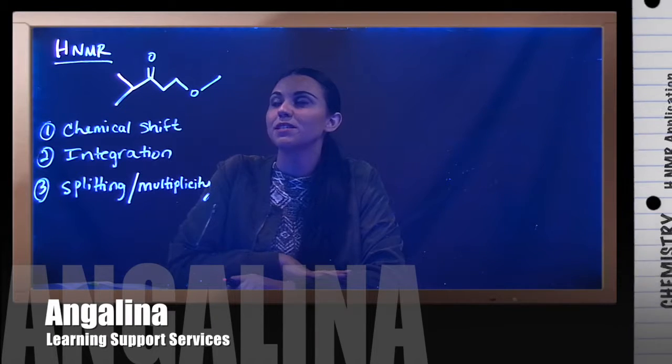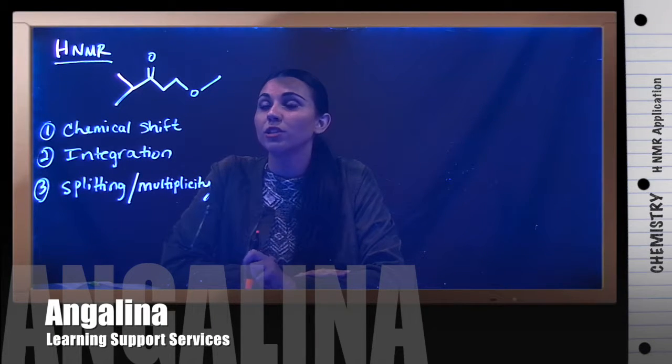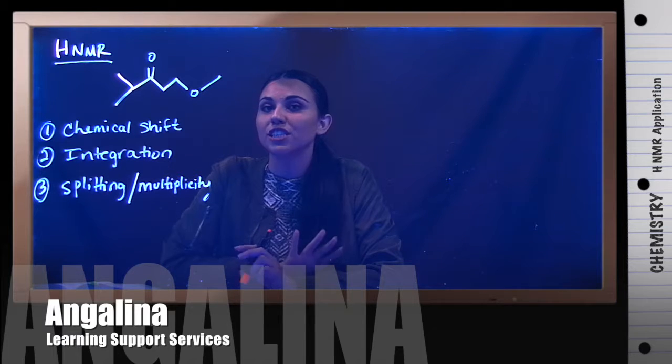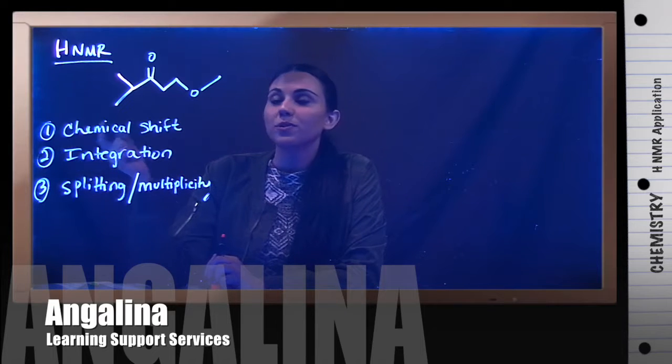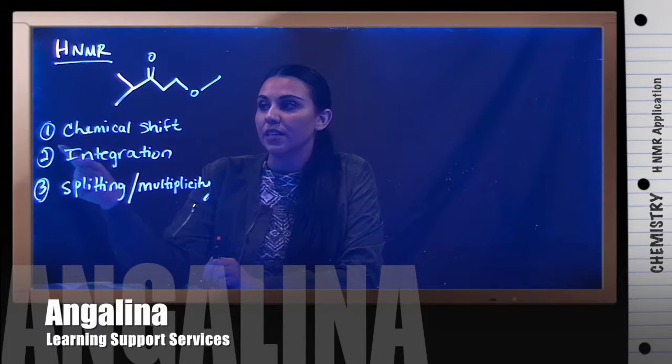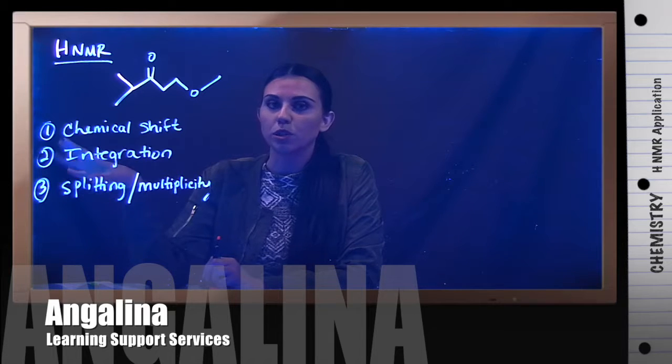In this example, we're going to be talking about H-NMR, which is different from carbon NMR, so just H-NMR. We're going to be working out this example here. So when we're doing H-NMR, we want to focus on three different things. We want to look at the chemical shift, the integration, and the splitting or multiplicity.